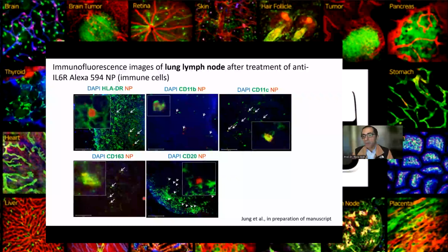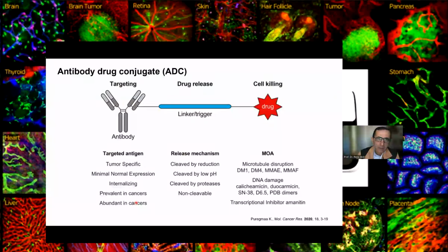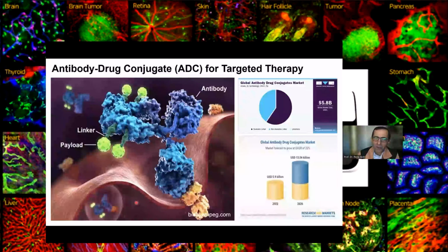I mean, even an organ on preservation fluid for 6 hours, and you basically inject the particles and take the lung out and image them live, and look at the uptake of these particles by different cell types in the organ. That would be really interesting. So some of those things we are doing with lung. And I think we are doing antibody drug delivery. I'm going to stop here.